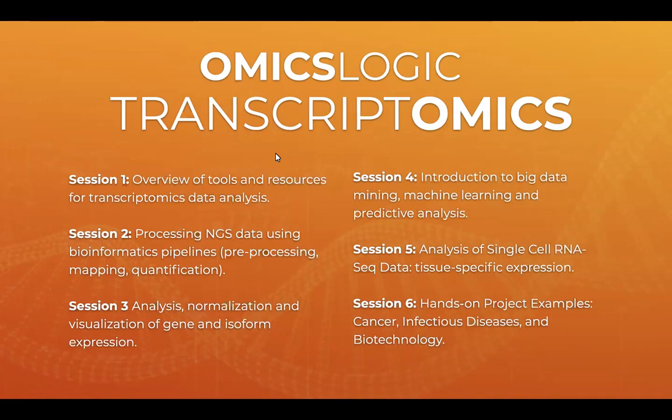For mapping onto reference genomes for well-characterized organisms like human and mouse, alignment-free strategies are also used, and we talked about those like Salmon and other approaches. So that is an important part in preparing your data for analysis.